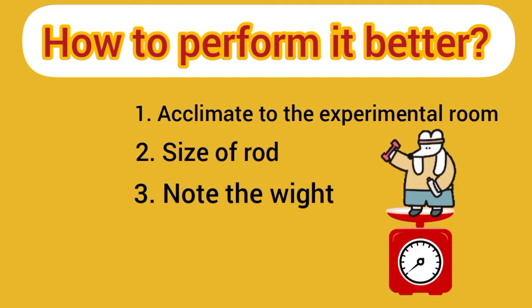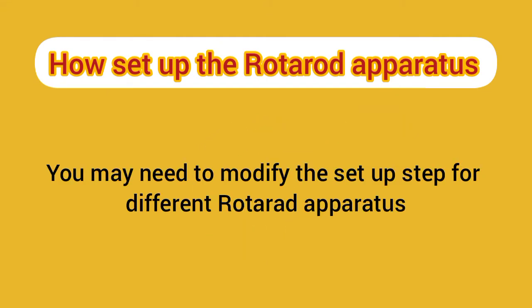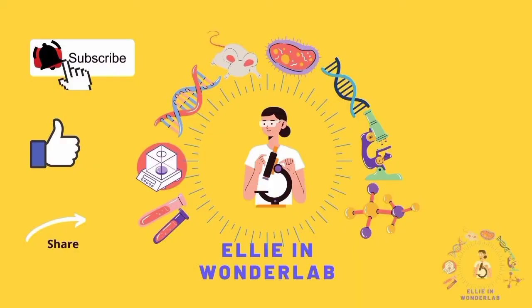Don't forget to take note of mouse weight. Now let's see how to set up the rotarod apparatus — this step may differ depending on your rotarod, but the rest is the same. In our lab we use the Ugo Basile rotarod with catalogue number 47600. Let's get started.